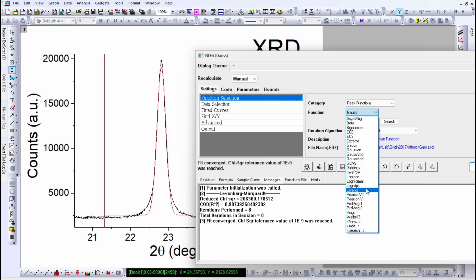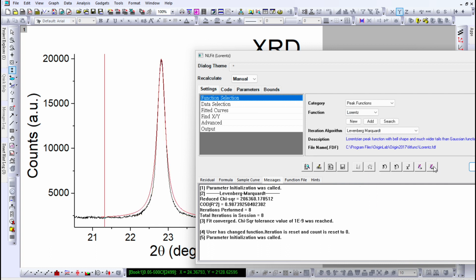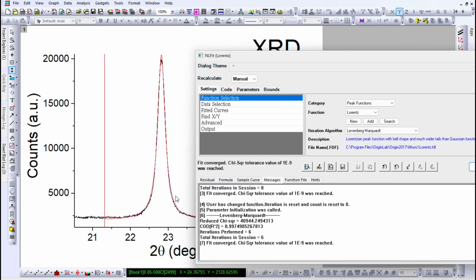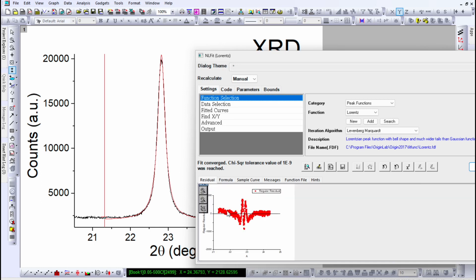Select the Lorentzian function and repeat the same procedure — click 'Fit Until Converge.' Now you can see the red line is almost overlapping with the experimental data. To assess the quality of fitting, look at the COD number which is 0.997, very close to 1, showing the fitting is very good. You can also click on residual to see the difference between the black experimental data and the red fitting curve.